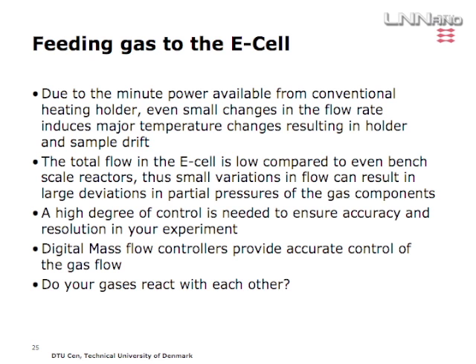One of the most important things is feeding gas into the E-cell, because in most cases you want to heat at the same time as you have gas in there. So due to the very limited power available in TEM holders, just having the flow of gases is going to drastically affect your temperature. And any of you who've been working with TEM holders, you know that when you change temperature, you can forget about high resolution microscopy because everything's drifting all over the place. So if you do not have a very steady flow of gas around your sample, you're screwed. So you need to be able to control the flow very accurately.